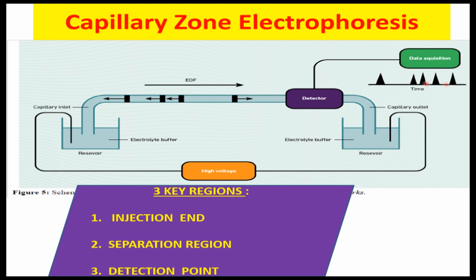It should be closer to the origin or far away from the origin based on, again, mass-charge ratio and charge intensity. It creates peaks at different locations, and this is how the three portions of capillary zone electrophoresis function to actually detect the sample.